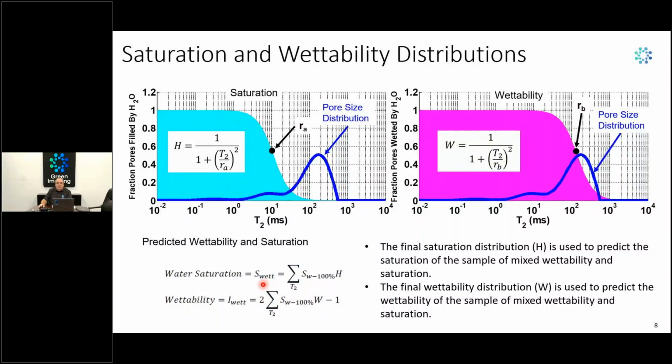As you'll see, this becomes really important because it allowed us to fully verify our measurements, because we can always, probably in some other method, whether it be mass or some other NMR measurement, determine the saturation. So we always have a way to double check that our model is predicting the correct water saturation.